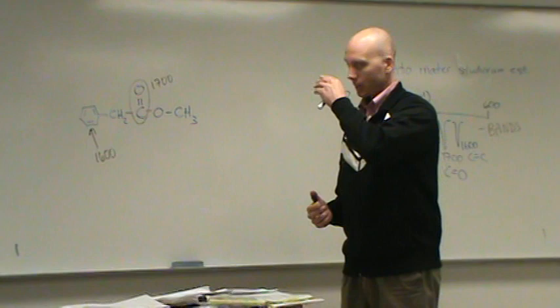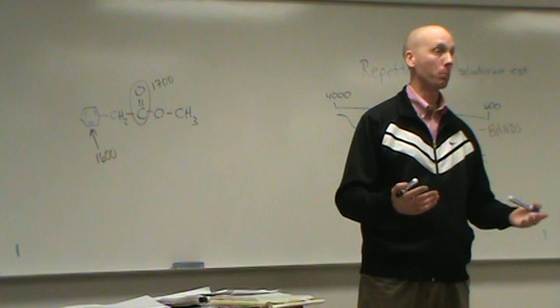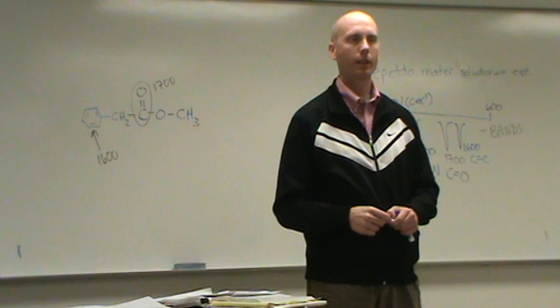So that's how IR works. See how kind of simple that is? Just gives you pieces of it. No way could you have drawn what that was, because there's thousands and billions of other options you could have done. Okay? Go down to the bottom one, 2,5-dimethyl-2,4-hexadiene. See what kind of information that one's giving you.